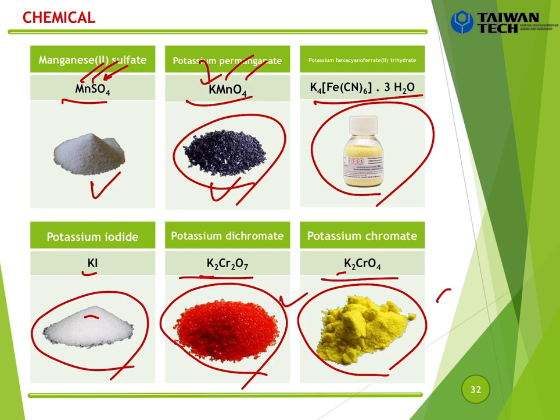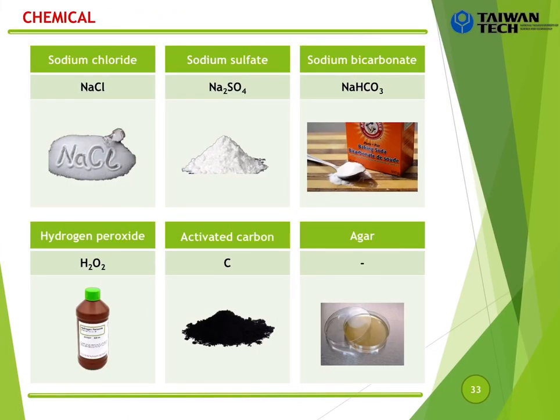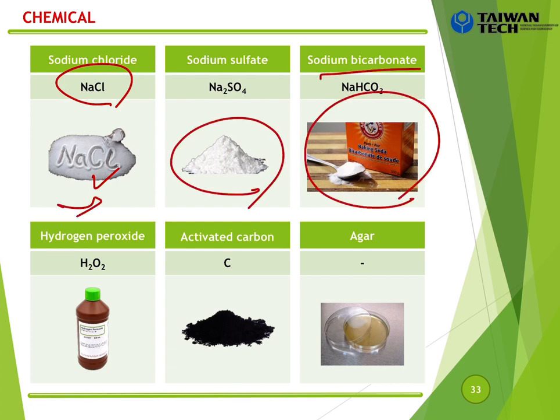This one we call physical properties, right? The color, okay? And also we have NaCl. So we have the white color and dissolved in water, you can get a transparent solution. This one also. And this one we have the baking soda, right? Or this is the name of the chemical here. You can see white color. And then when you dissolve in water, it becomes a transparent solution.